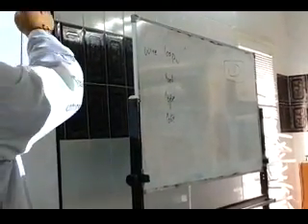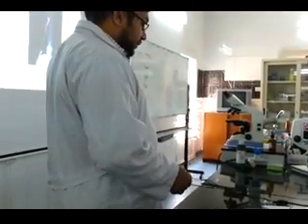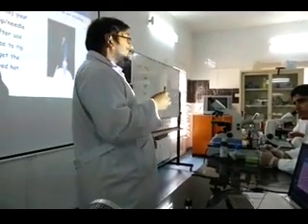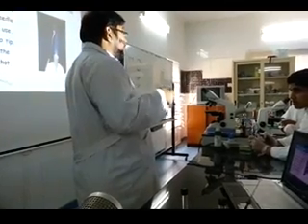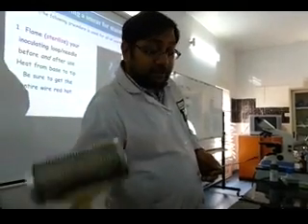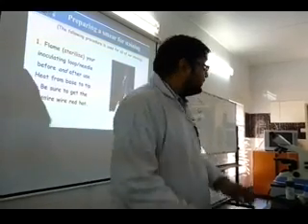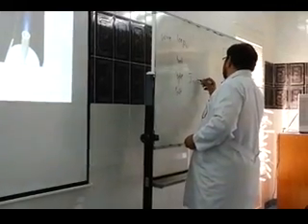You see the circle inside here? This is used for taking bacteria from here and transporting it. So you know bacteria are everywhere. When we need to transport bacteria from here to there or mix the smear, we first need this loop to be sterile. If it has already got some other bacteria on it, it will mix with the bacteria that you are taking and it will cause problems. And this thing here is called what? Not fire, not heater. It's called an incinerator.